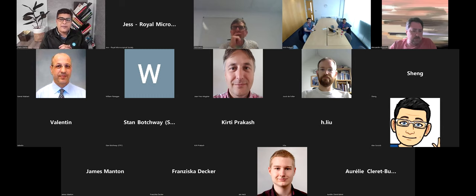Wow, okay. Could I just ask a supplementary question? How many Z slices are you typically taking? Sorry, I didn't catch that. How many Z slices? In that stack, I'll have to look into the data, but on the order of 100. Okay, yeah. All right, thank you.